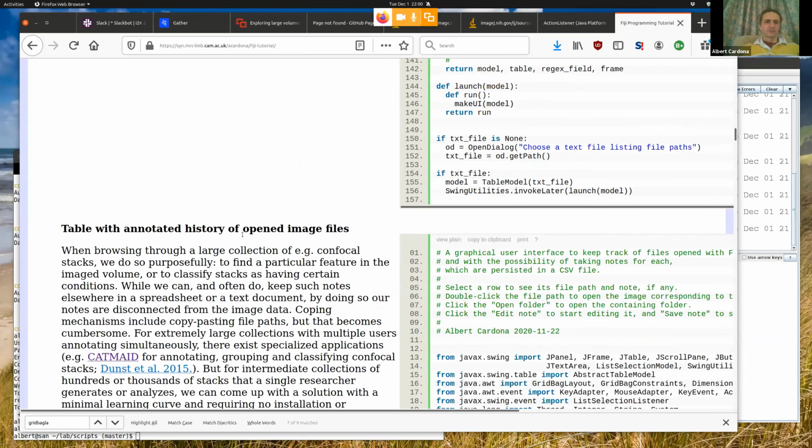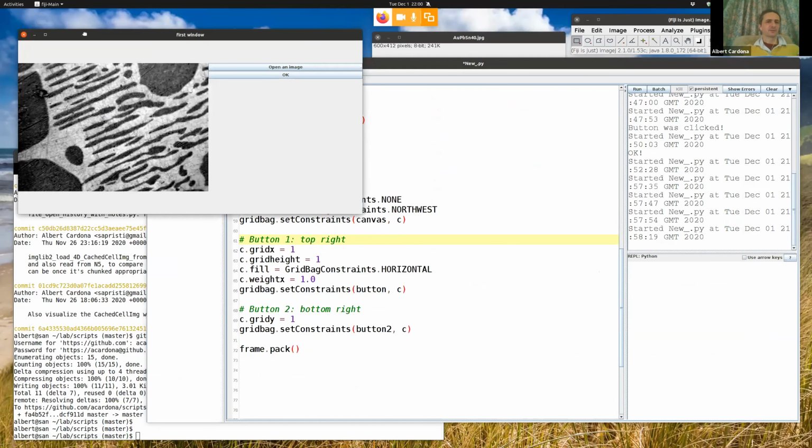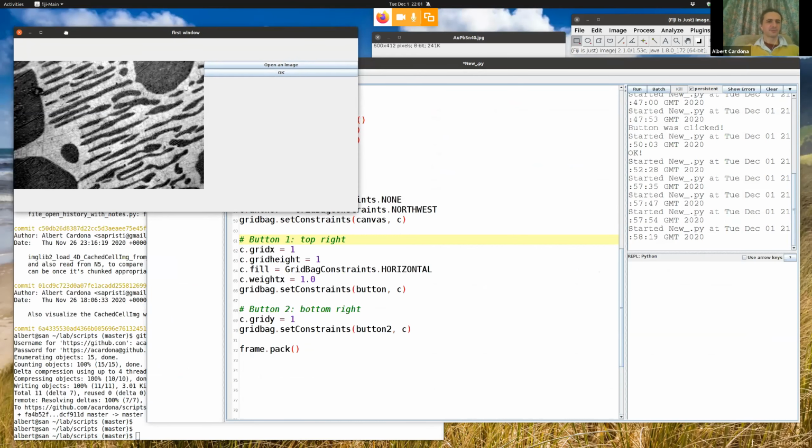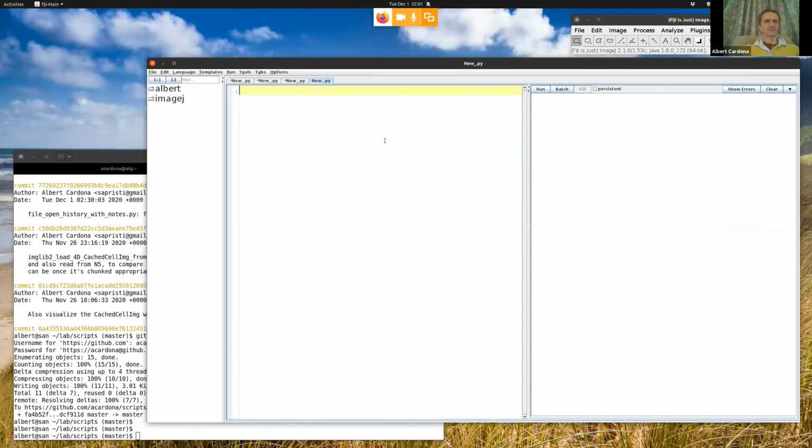Right, so now what I wanted to do is open exactly that example and walk you through what it is doing. And maybe before that example, I should touch on the simpler one of managing large collections of files, which likely you'll be more interested in. So I'm going to close this frame. I'm going to close that frame. And we can open a new one.